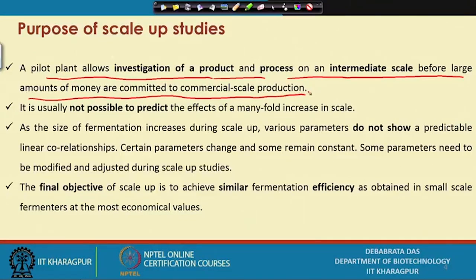So we do agree that when you run any kind of process at a small scale, the monetary involvement of the process will be very less. Am I right? Now when you go to the bigger scale, then monetary involvement will be very high. So naturally, when we go for the high investment, the investor should be confident that whatever results we get in the small scale, the same should be available in the bigger scale.